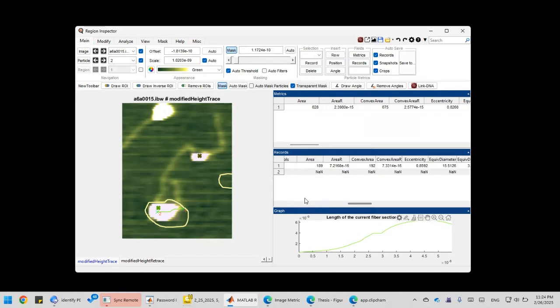Yeah, I think it's not added to this one. Yeah, here we go. Sometimes you may accidentally drag these polygons around. It doesn't matter. The region is still restricted to the complexes that were previously drawn. So if you uncheck the transparency, that's exactly what we want, right?